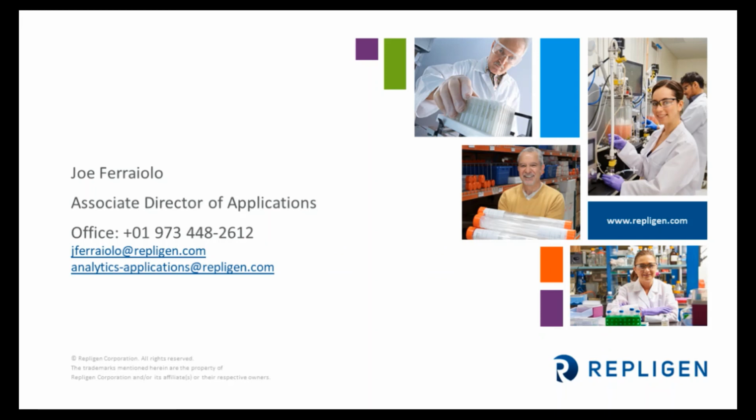Okay. And what is the accuracy that you have to determine the path length, and how does the error to fix the path length propagate to the analytical determination? Is that part of the same? Sure. So you would obviously be running some sort of system suitability standard prior to the run. And the R-squared value of that linear regression is your evidence that you have the linear data.